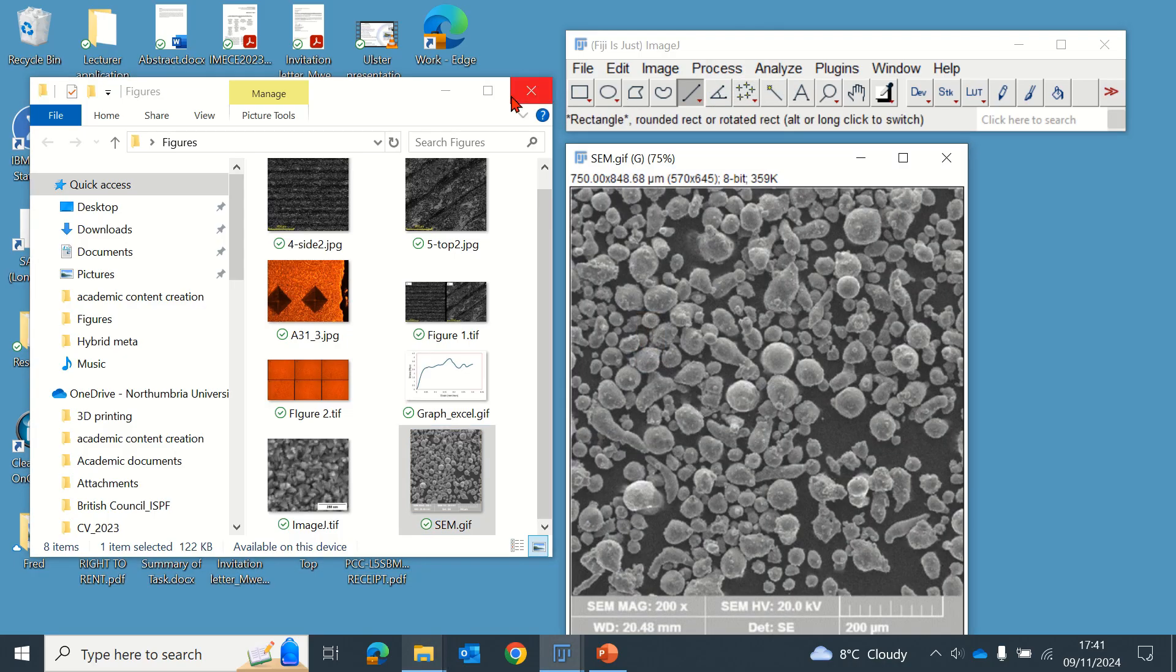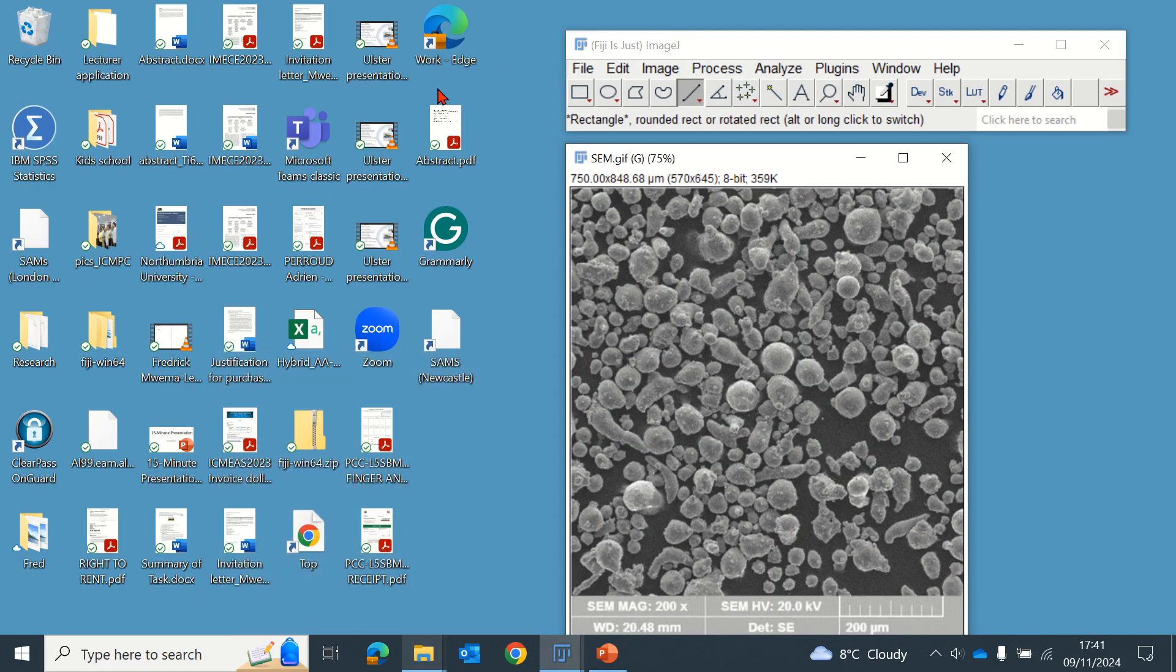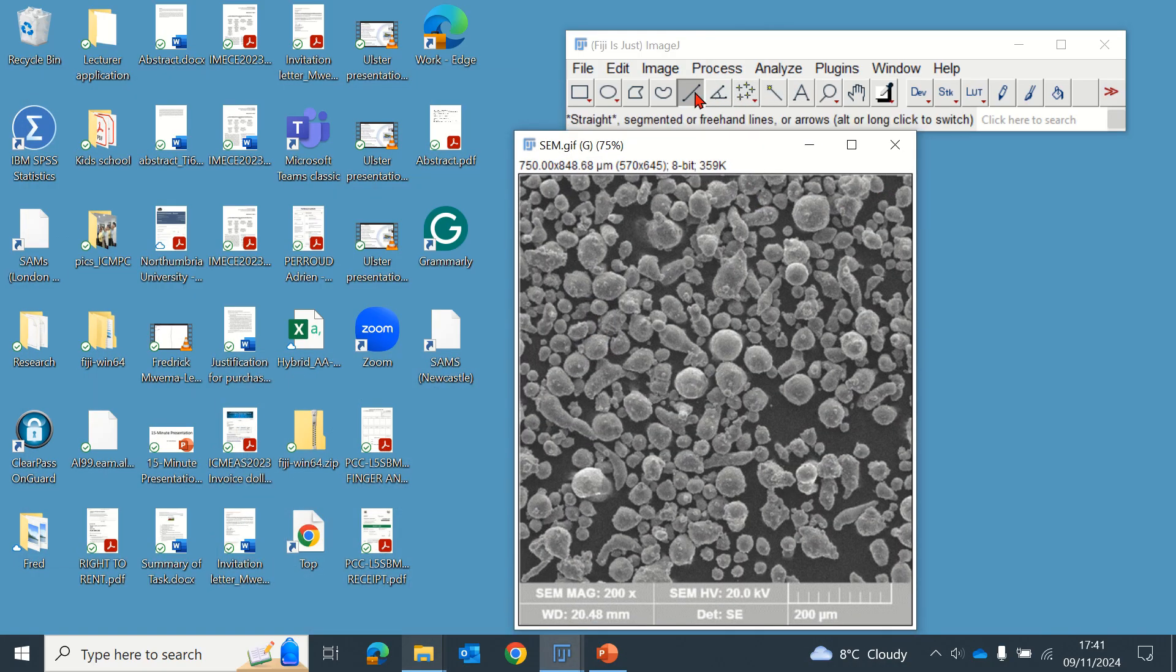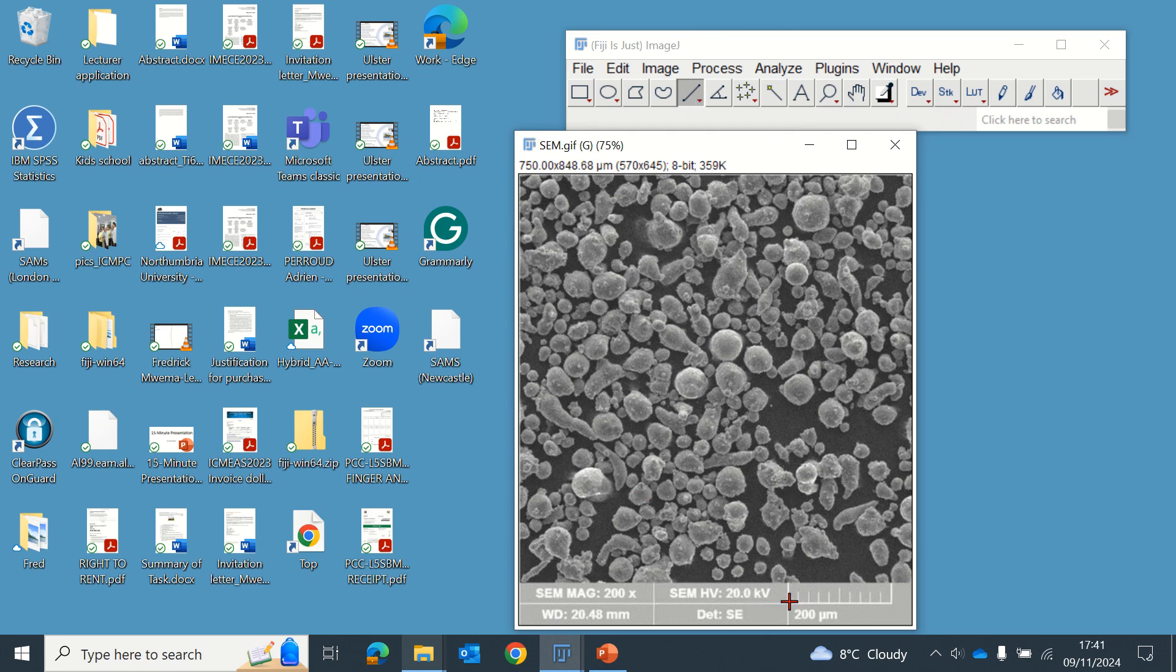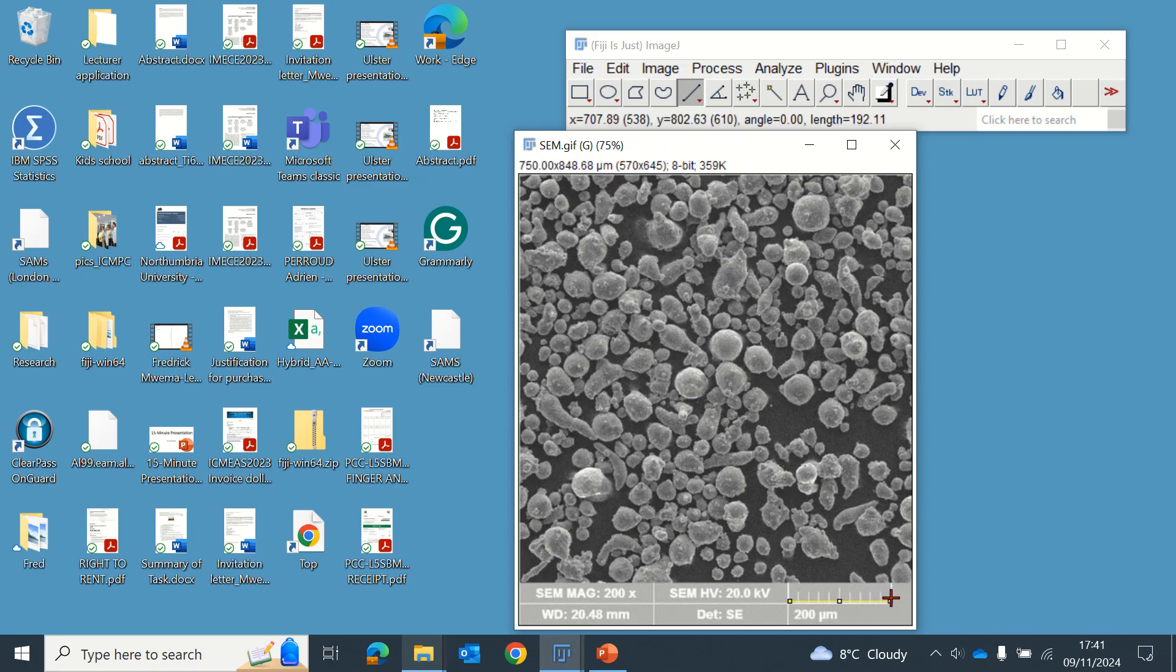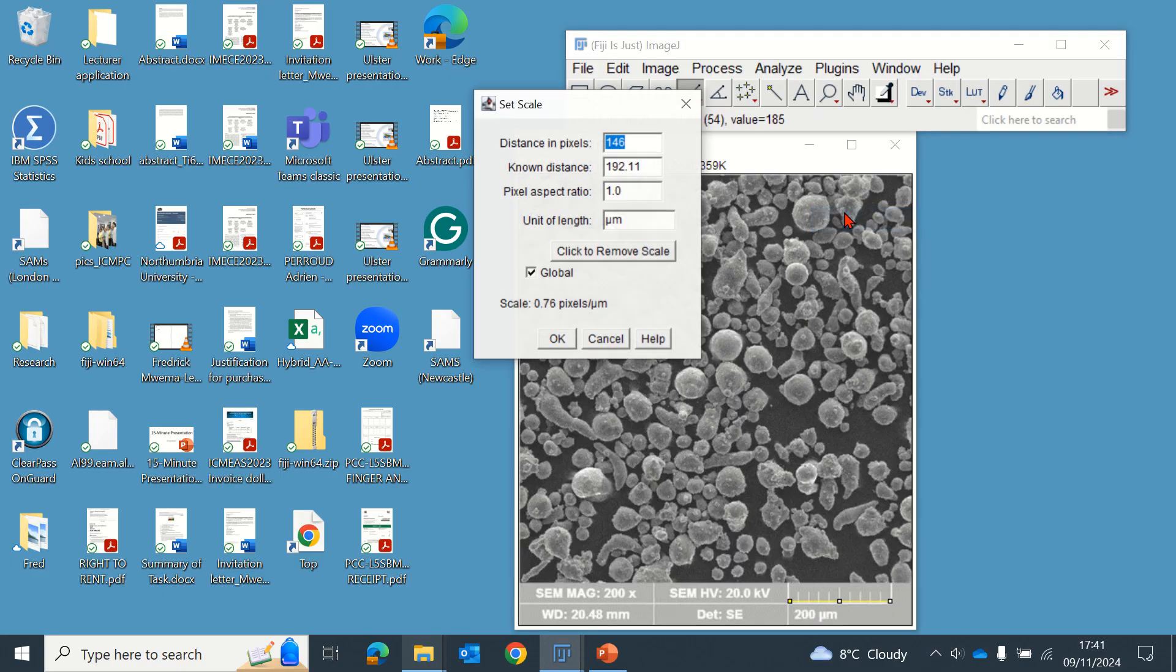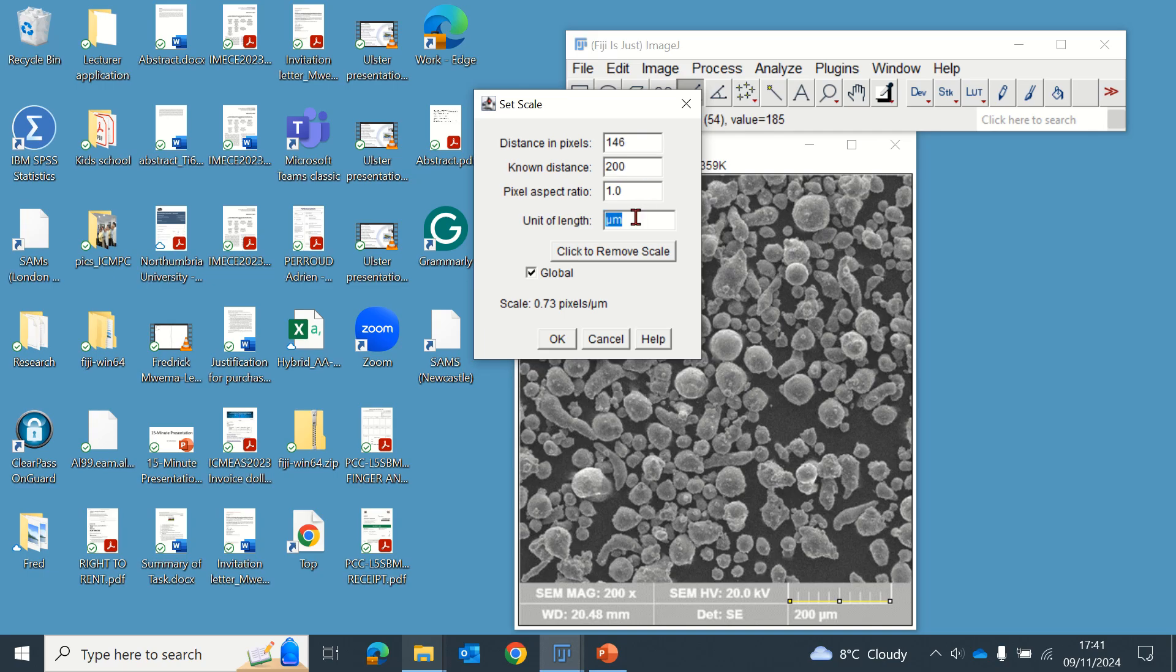The first thing you do is to set a scale. We can see the field of view for this SEM image is provided as 200 micrometers, so you set the scale. That scale is 200 micrometers, which is global so that every other image is able to take that scale.